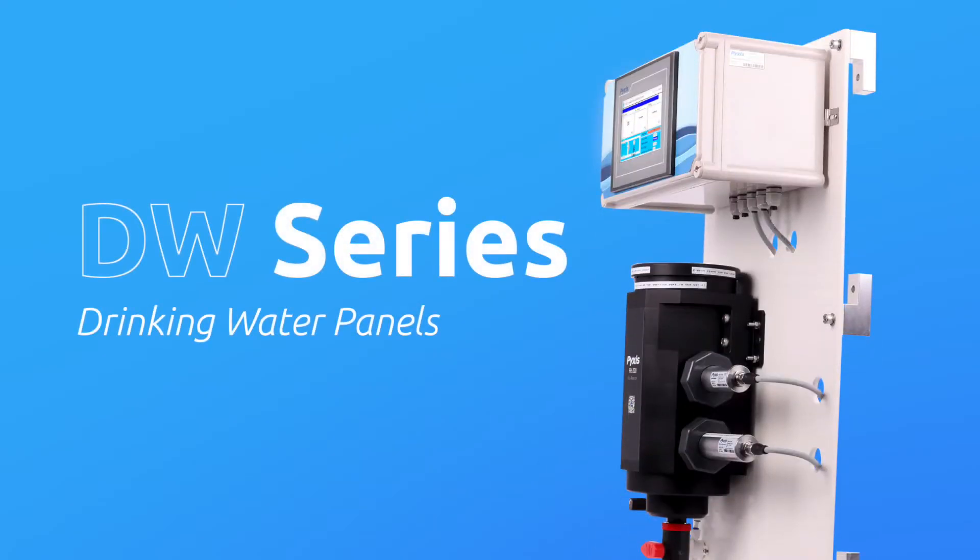Pixis Lab is pleased to announce the formal launch of the DW Series panel-mounted analyzers, specifically designed for drinking water and clean water monitoring applications. The DW Series panels incorporate Pixis Lab's new groundbreaking smart sensor technology in a ready-to-install panel-mounted platform.